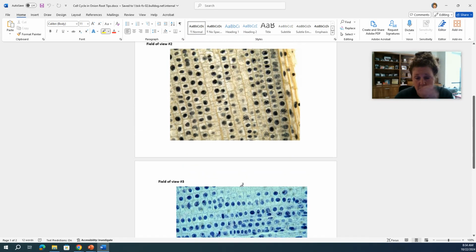Now, because we're dealing with plant cells, when they are undergoing cytokinesis, they have the formation of a cell plate. And so like in this cell here, you can see that they're on opposite ends, but they're actually starting to go back into circular formation to form a nucleus. And you can also see this faint line right here. And that right there is your cell plate. And so the cytokinesis stage is not part of mitosis, but it starts happening around telophase.